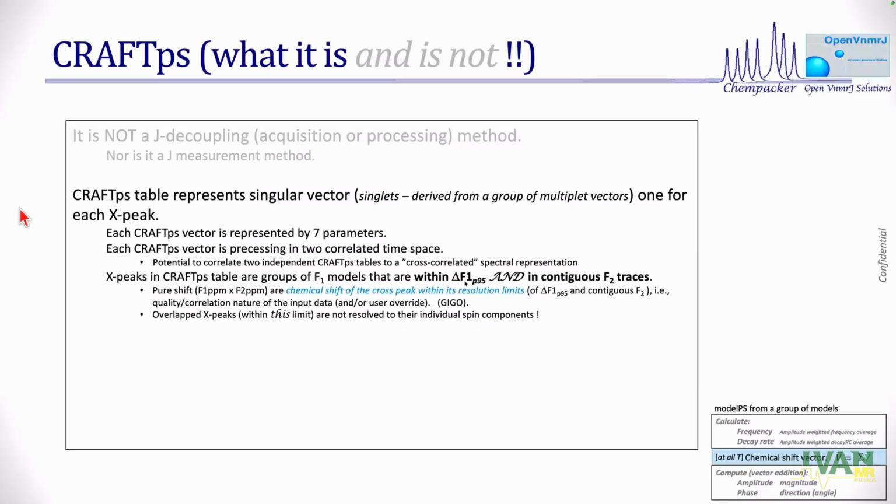It's completely up to you. You don't even need to go back and redo anything. Just go back to the table and say, group it that way. So there is a way that the user can override it. So there is some room to do this. Contiguous F2 is, most of the time, a challenge we actually face and don't resolve, because we are working with truncated fits and all that.